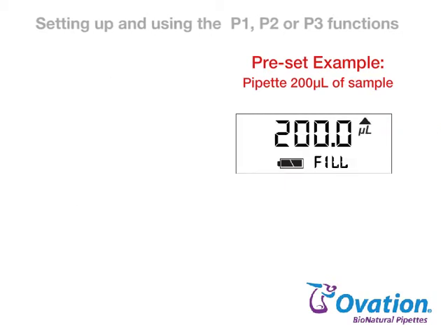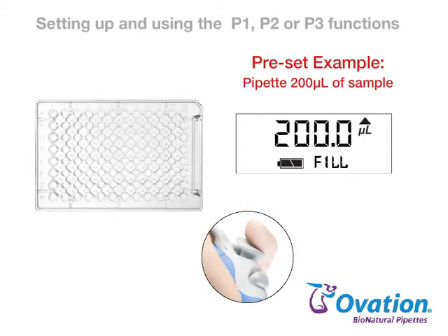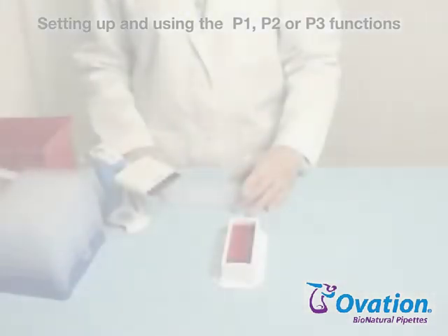Aspirate sample by pressing and releasing the pipetting trigger. Press the pipetting trigger again to dispense sample with overblow to expel all liquid. Here's the pipetting function in use.